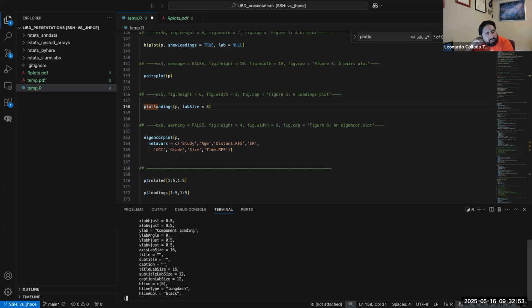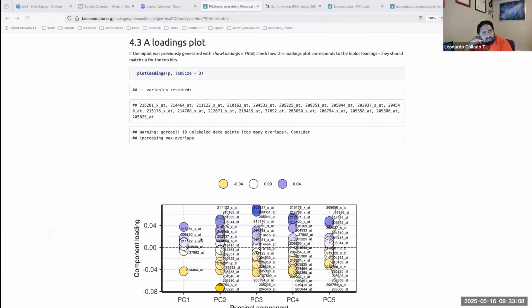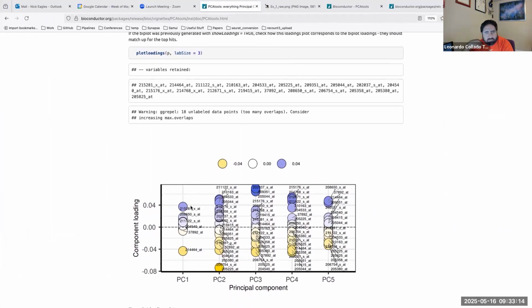It was the second argument. Okay, I just skipped right over that. Get components, PCA, length 5. So it's how many components you want. I was thinking that you could customize how many genes show up here in the loadings.